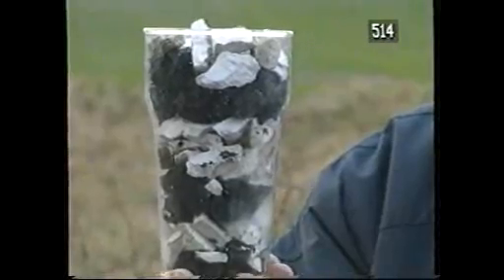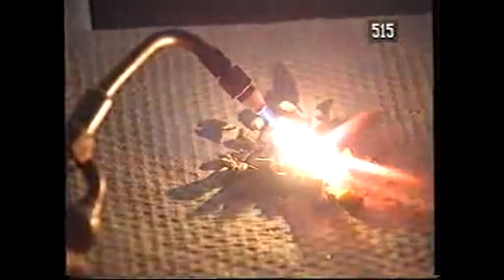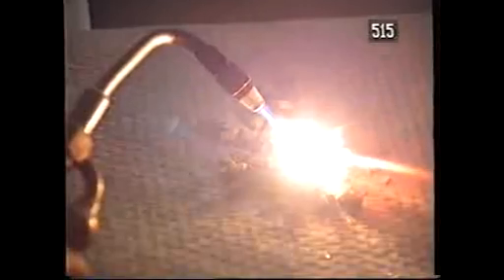Let's see the reaction for ourselves. What you're seeing here is the reaction that goes on in a lime kiln, but at a much higher temperature. I'm using a methane oxygen flame and playing it directly onto the chalk, calcium carbonate. The white light that's produced often crops up in everyday conversation. It's called limelight, and it's emitted by a product of the reaction, calcium oxide or quicklime. Limelight appears when quicklime reaches a very high temperature. So, when you heat calcium carbonate, calcium oxide or quicklime is one of the products. The other is carbon dioxide gas.